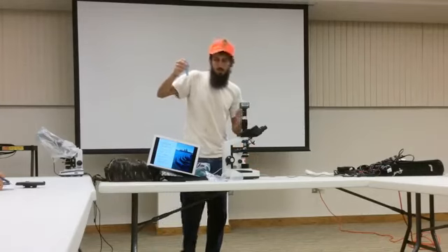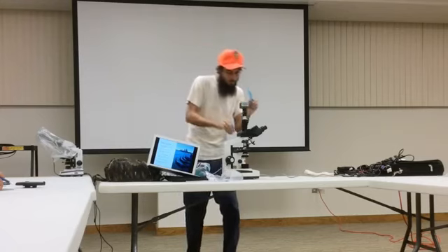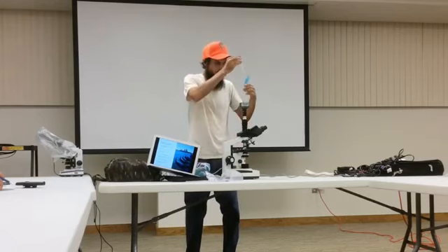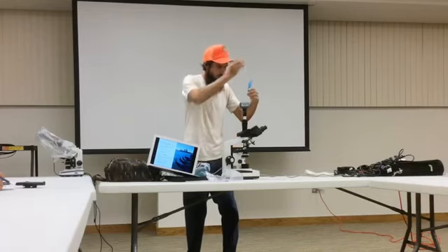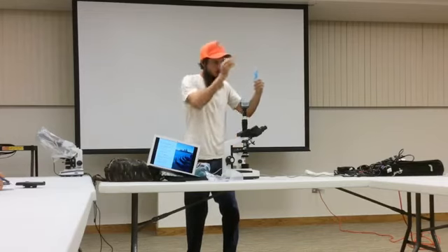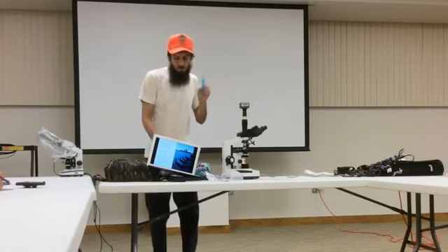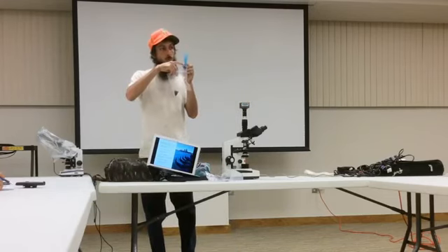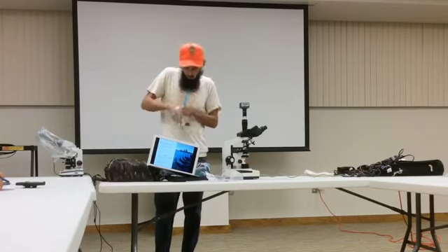So I fill up my measure to 4 milliliters of water, and then I add in dirt until it goes up to 5. And then I know I've got enough 1 to 5 in there.